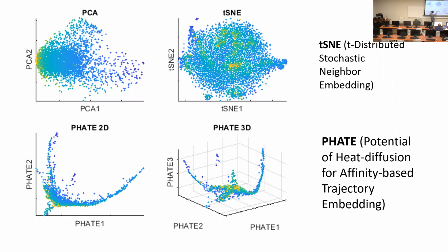I will embed the cells and only select the cells in this circle. By the way, they are all G1 phase cells. It's already highly homogeneous, but we will just select this. Those steps are really important to help you find a homogeneous population of cells in order to estimate the expression noise level.